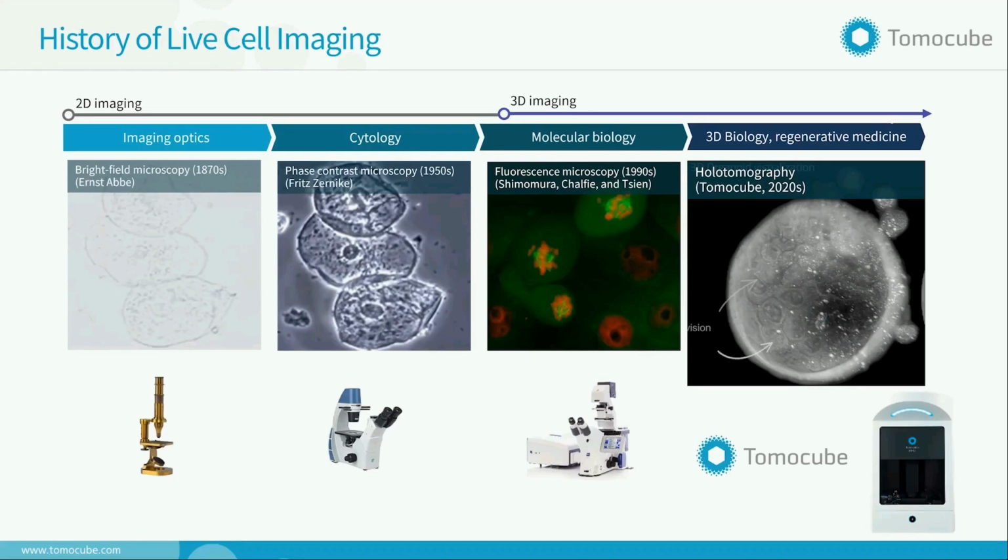During the 1990s, scientists developed a series of techniques to fluorescently label specific proteins using fluorescent protein techniques, which opened the doors to molecular biologists by adapting fluorescence microscopy.